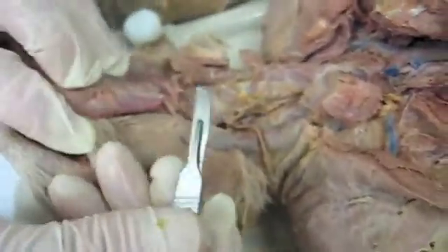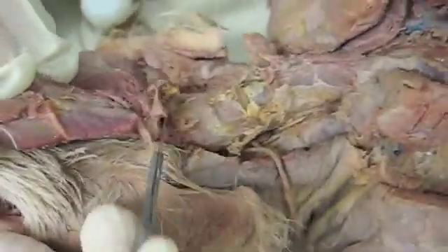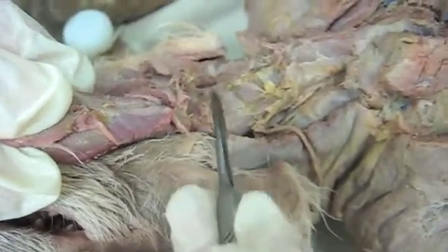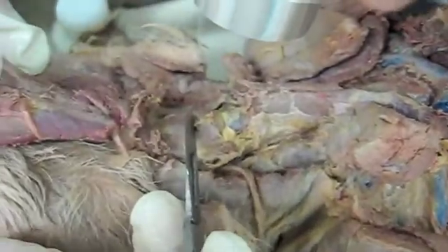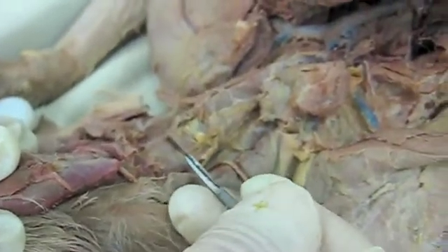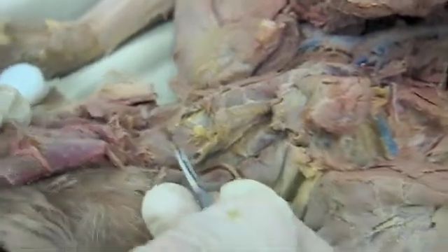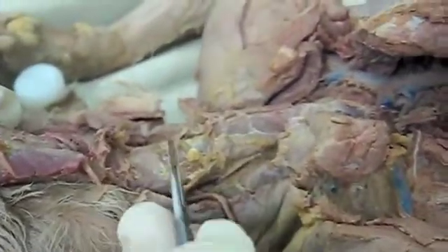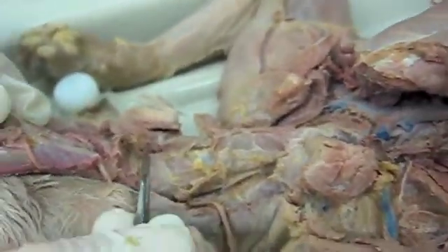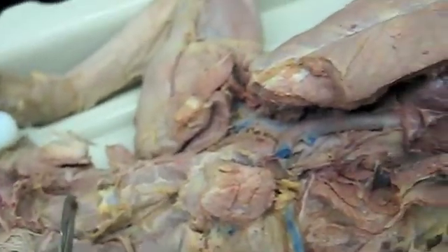On the ventral side of the larynx here, there's a pair of big cartilages on either side. They get a little bit discolored sometimes with the muscle tissue, but this big cartilage on either side here would be the thyroid cartilage. Okay. And then back here, there's still some muscle tissue covering it, but can you see, I can put the scalpel right here and then right back of it there. So there's a ring of cartilage right here. There's the front of it and there's the back of it before we get down here into the trachea. So that little rounded cartilage right there is the cricoid cartilage. So thyroid is the big one. Okay. And then cricoid is the ring just behind it.